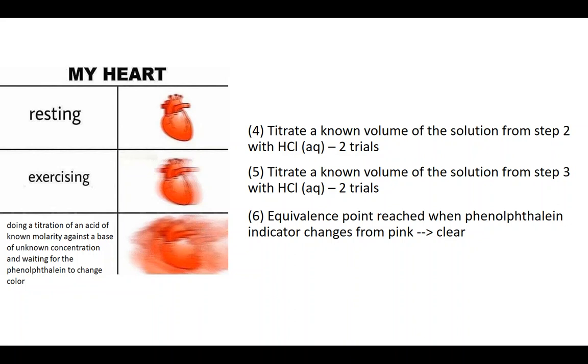And you know that you've reached the equivalence point in these titrations, not because you'd be monitoring this with a pH probe. You wouldn't be doing that like you would have last week. You'd just be using an indicator like phenolphthalein.